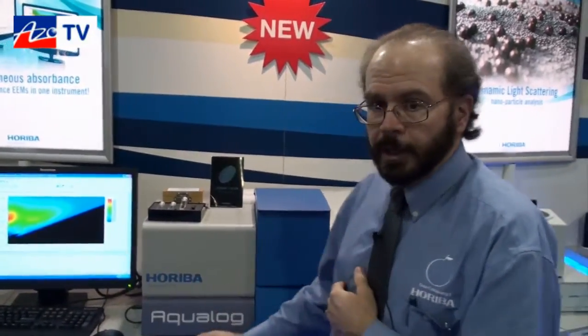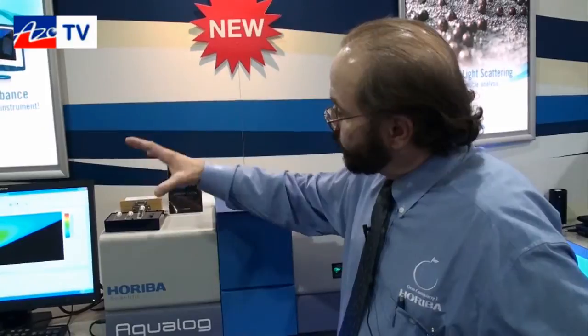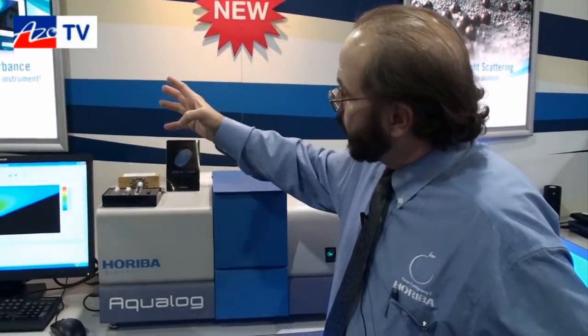With that I'd like to invite everybody to come and see us on our website where we can answer any other further questions that you have, and thank you very much for your attention. Just before we finish up, what are typical applications for the Aqualog? You were saying before that it gets used for water analysis, what other things do people use it for? Well primarily it's for analyzing dissolved organic matter, the compound is known as CDOM.